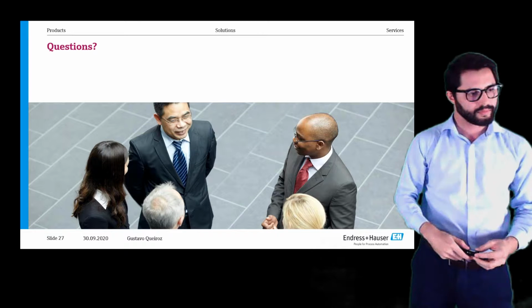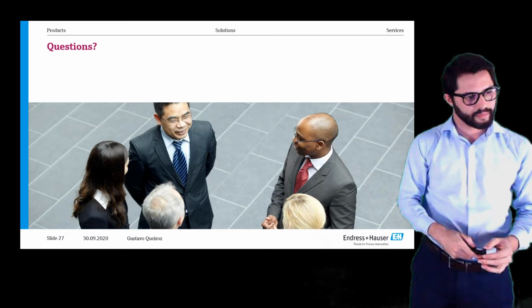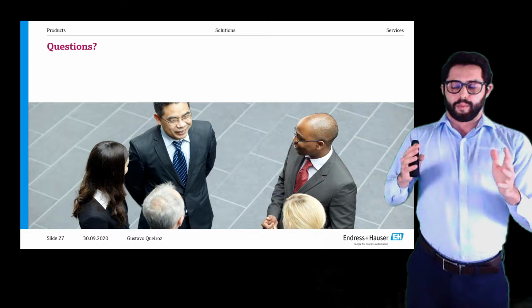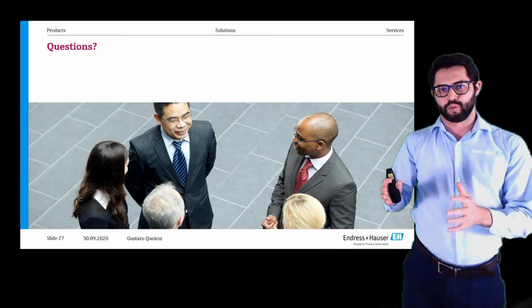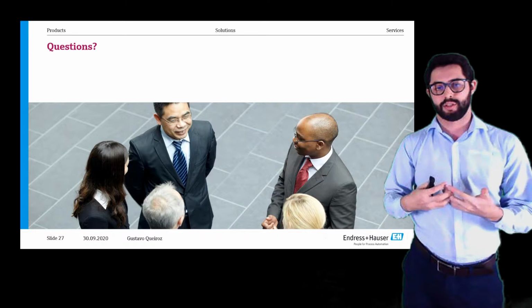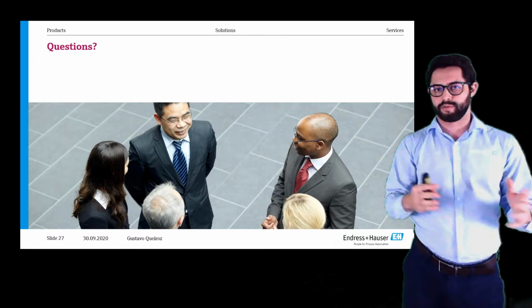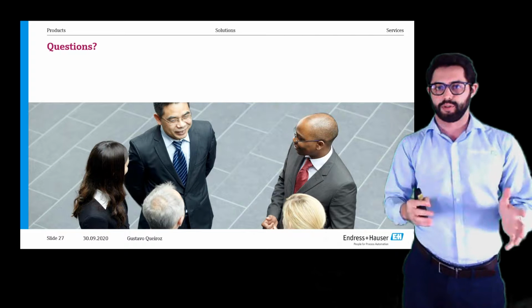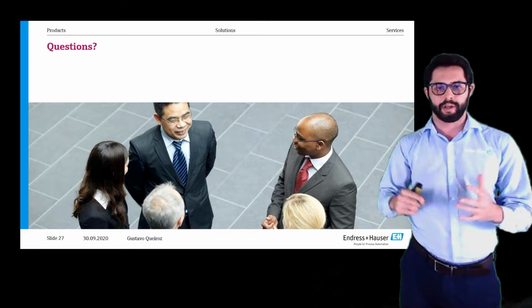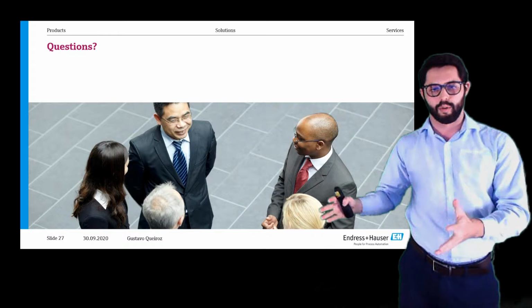The first question is from Michael. He asks what the disadvantages of ISFET sensors are compared to glass. Okay. When the first ISFET sensors were launched in the market, they had a very low resistance, especially to CIP exposure. So with the first generation of ISFET electrodes from Endress+Hauser, whenever you exposed it to CIP applications, sodium hydroxide at high temperature, you would reduce the lifetime of the pH electrode to some hours or a couple of days.